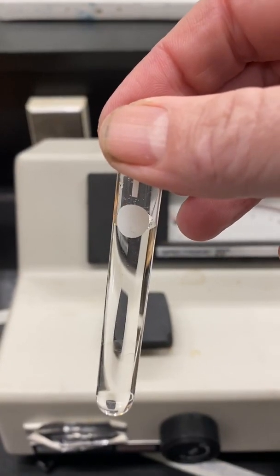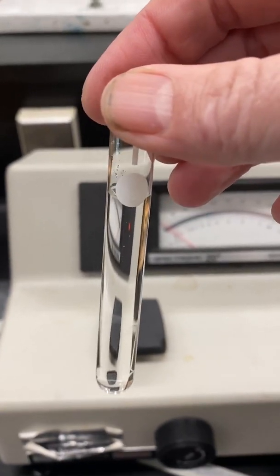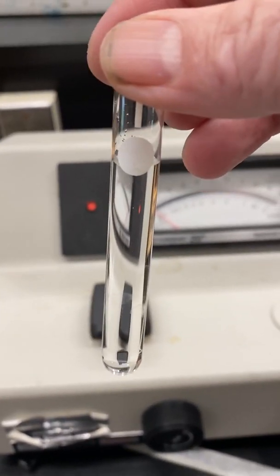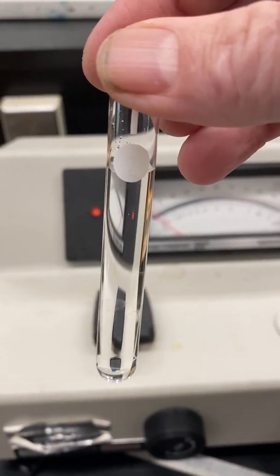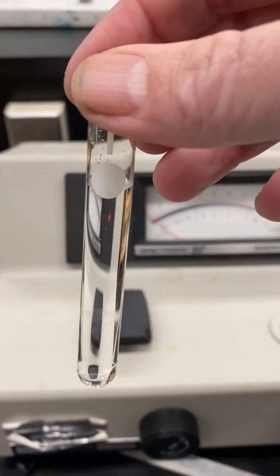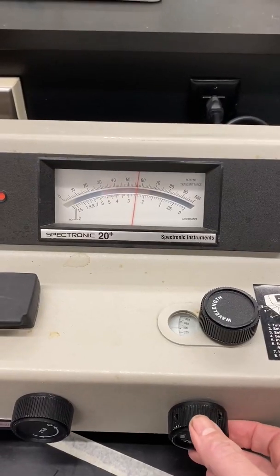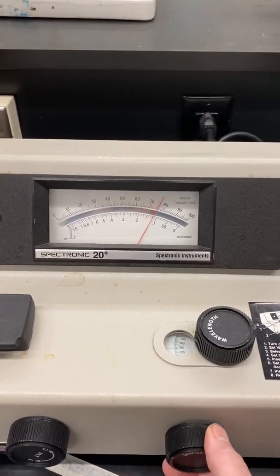Next, fill the cuvette with distilled water at least to the bottom of the solid circle on the side. Wipe off the outside of the cuvette with a Kim wipe. Then place the cuvette in the sample compartment with the white stripe facing you. Use the right knob to set the 100% transmittance.